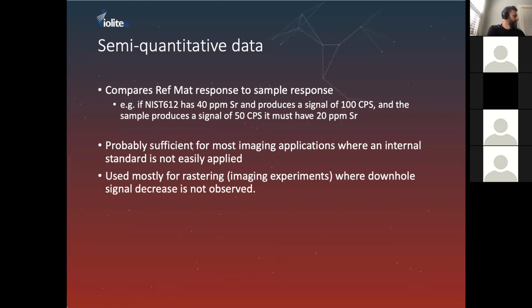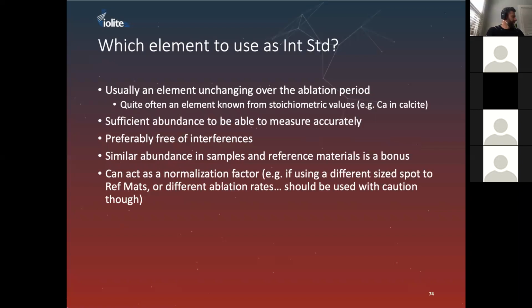I think I've mentioned that bit. When you are doing pit analyses, spot analyses, then you probably want to use the internal standard approach. And the idea of the internal standard is that you will have a sample. Actually, I can sketch this out.